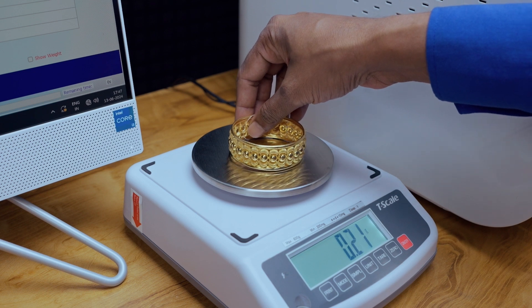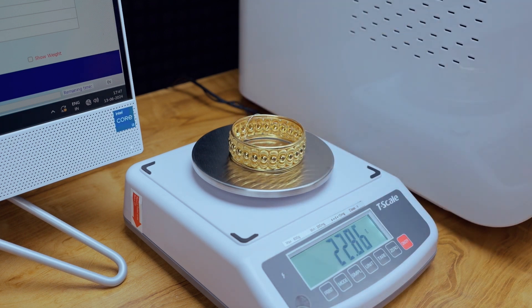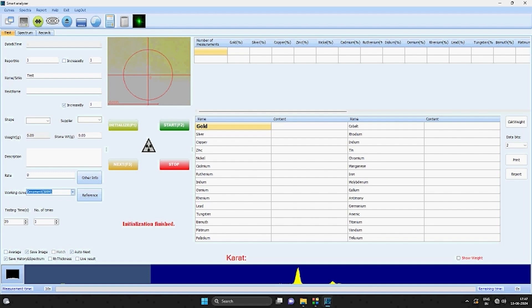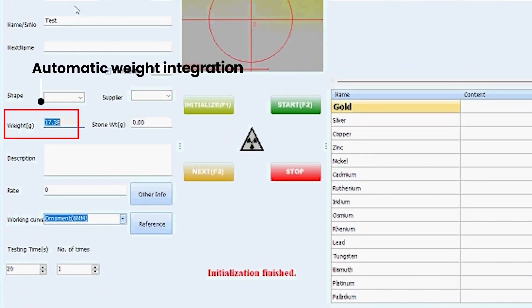The weight integration facility ensures exact valuation according to weight and is useful for future reference against transactions.